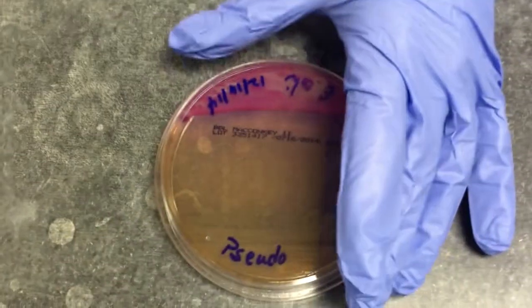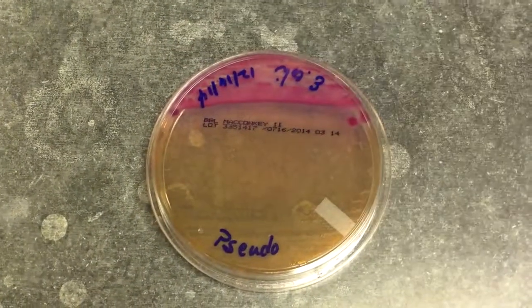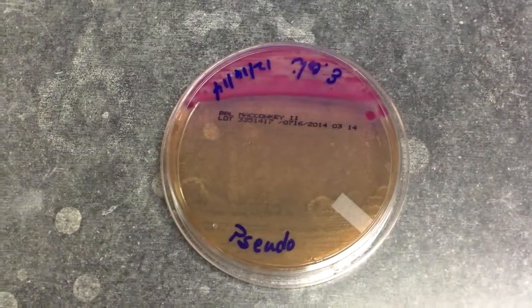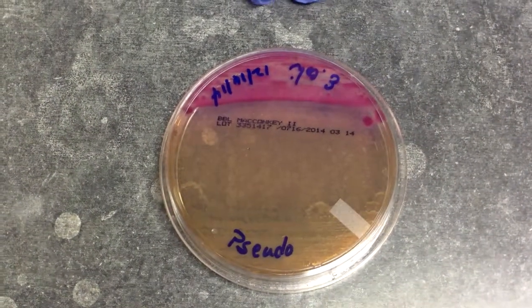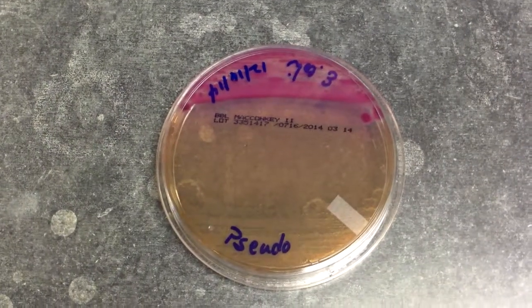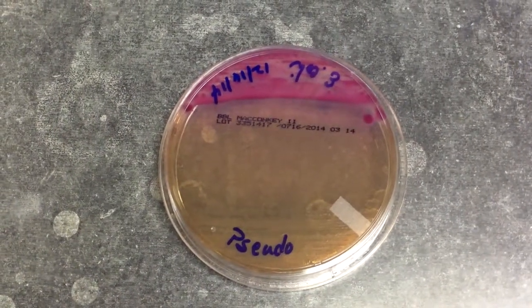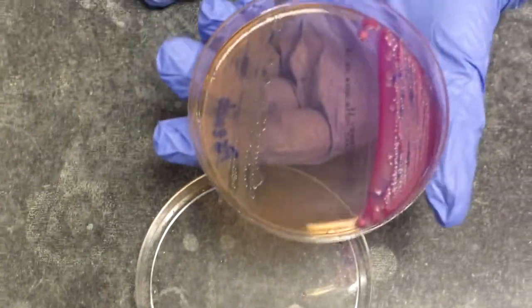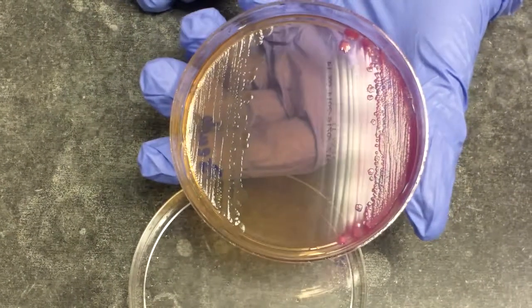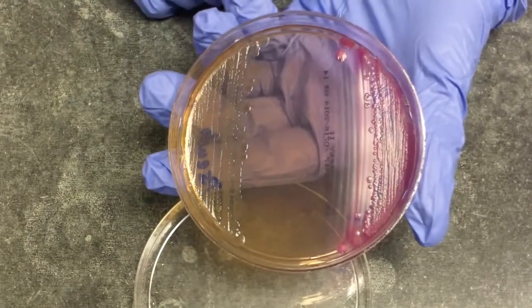MacConkey is a differential agar in that it allows groups of microbes to be visually distinguished by the appearance of the colony or the surrounding media based on biochemical differences between the two groups. MacConkey agar will distinguish a lactose fermenting gram-negative bacilli from a non-lactose fermenting gram-negative bacilli.